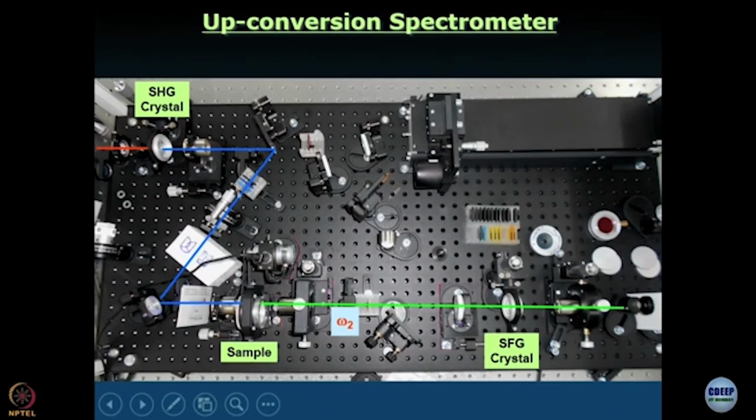Here, if you look carefully, you will see there is another something. Here also you have some filters. These are a different kind of filter. They are called neutral density filters. What is the meaning of a neutral density filter? Something that ideally cuts down a lot of the light going through irrespective of wavelength. So, if you plot absorbance or rather percentage transmittance against wavelength, then you expect to see a flat line in case of neutral density filters, a flat line that is at 50%, 20%, 10%, 1% depending on your need.